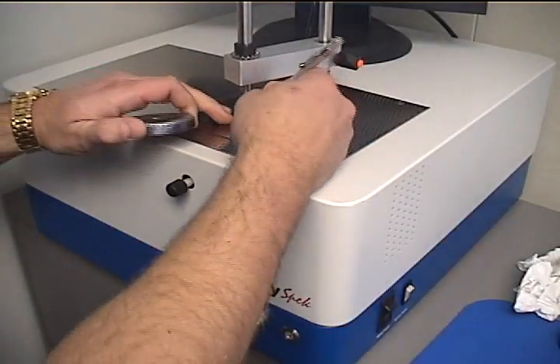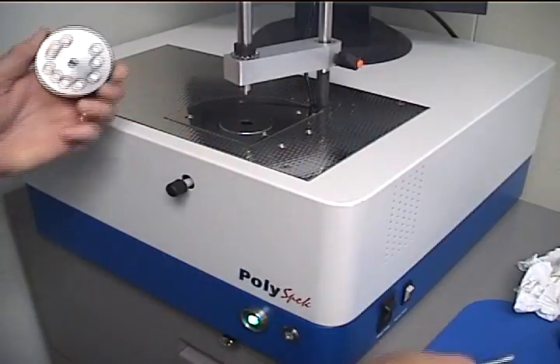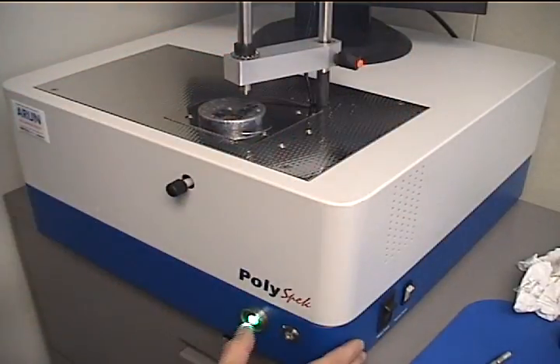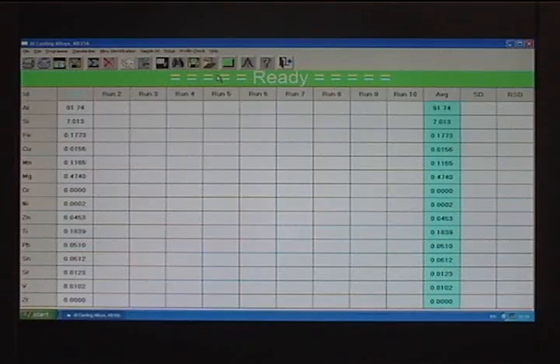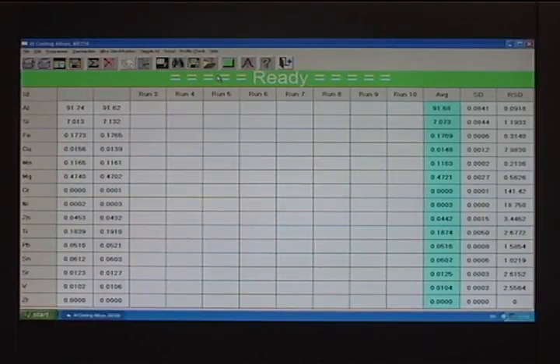The sample is now removed from the spark stand, the electrode tip is brushed, and the sample is analyzed again to obtain two repeatable burns. The same analysis in progress window comes up, keeping the operator informed of where the instrument is in the analytical cycle. When the burn is finished, the results from the second spark appear along with an average, standard deviation, and relative standard deviation.